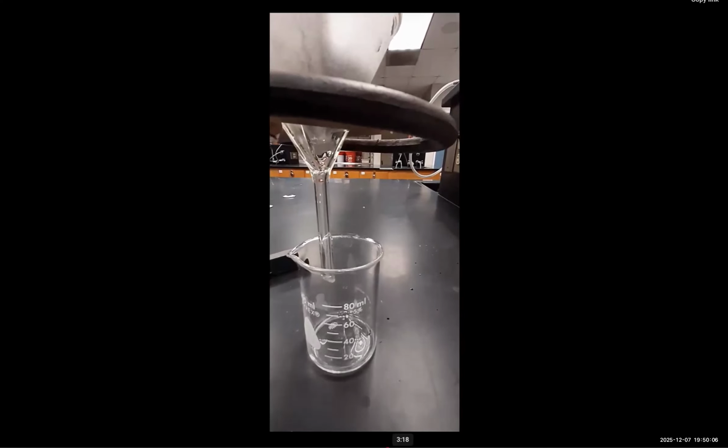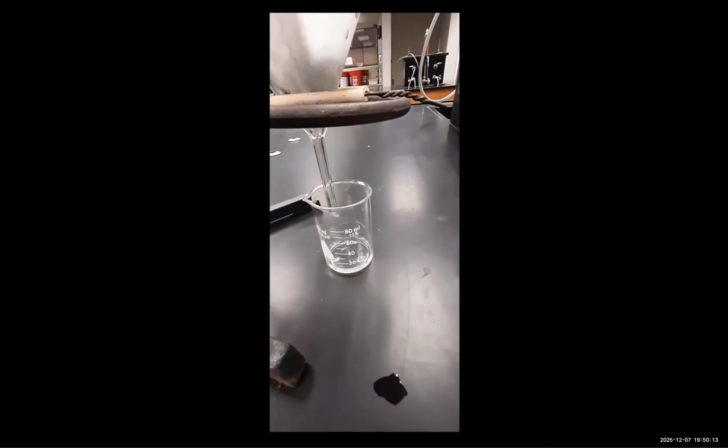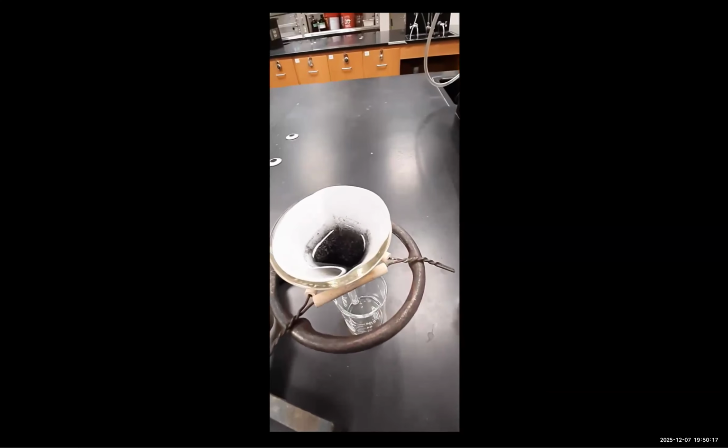Still going, takes a while. After several minutes, as you can notice, the solution after it passes through the filter is clear, while the solution before filtration is a black color.